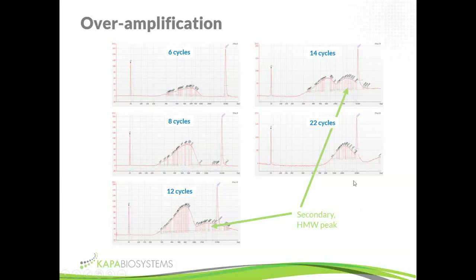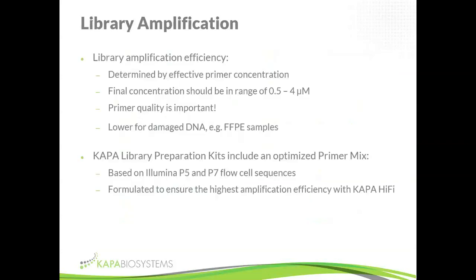And so that's just why it's really important to optimize the PCR conditions very well. And also, what we'll come to later is how we measure it.